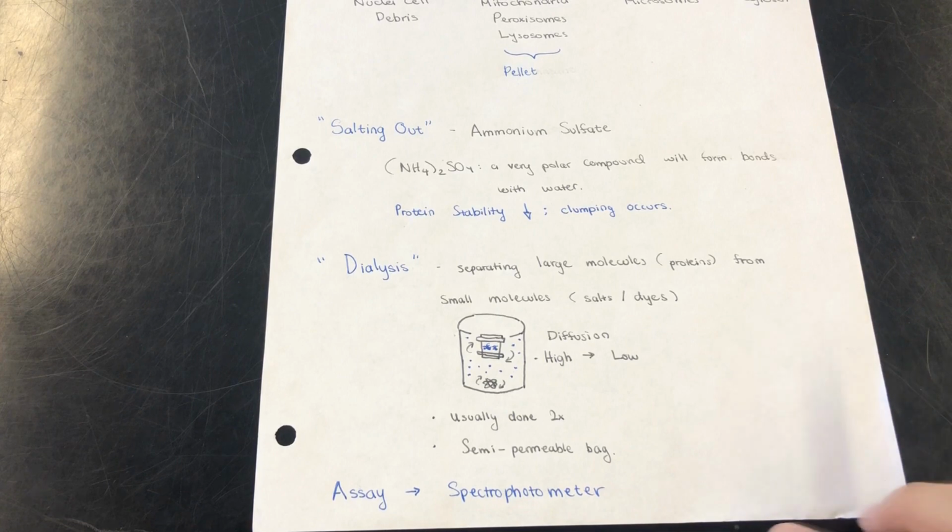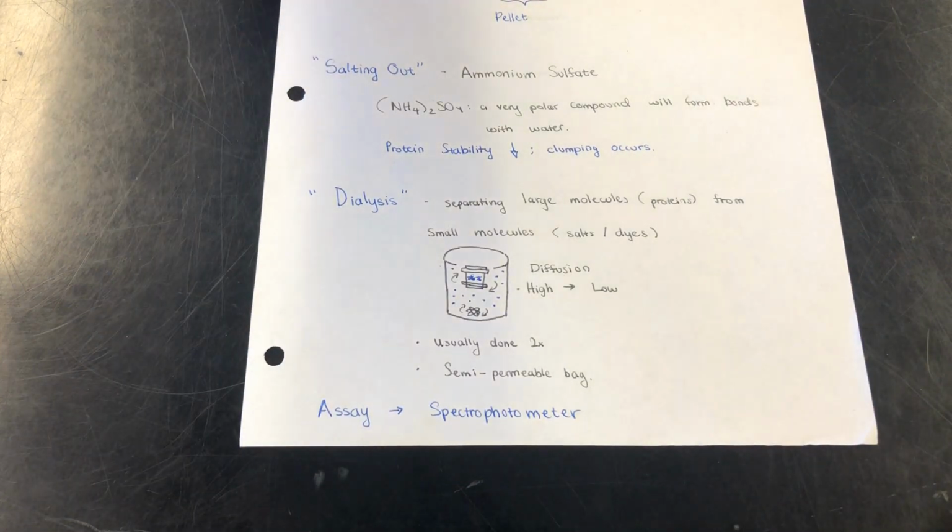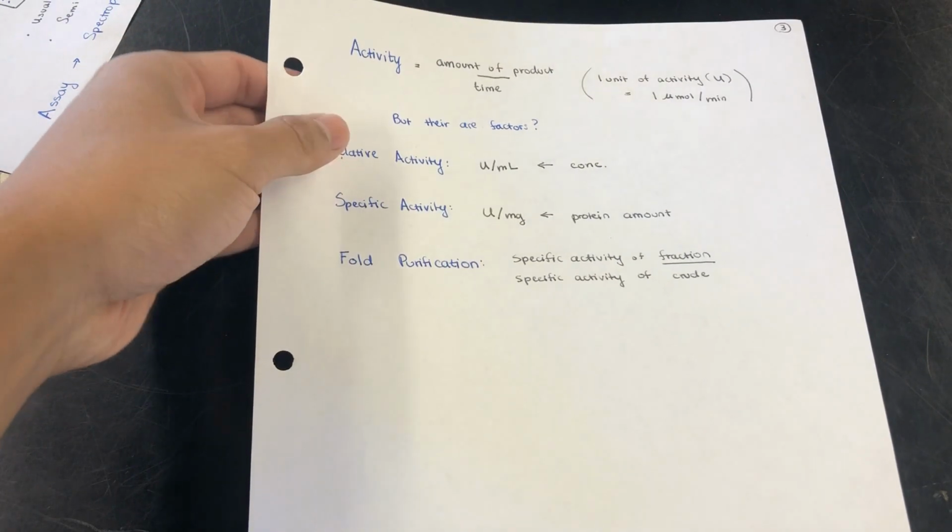And then you move on to your assay, and you use the spectrophotometer to look for absorbance. At this point comes the calculations where you do activity. And then you have your relative activity, which you can calculate. And then specific activity and fold purification are done with the Bradford.